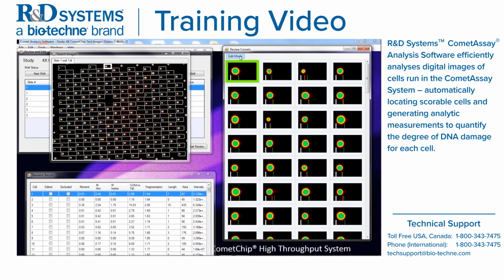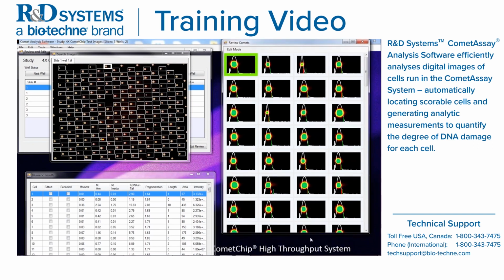The second way of editing is you can go over here into the review window. I first recommend that you go under Edit and select Show Intensity Profile. This is going to show the intensity profile relative to the comet. So in this first slide must have been untreated cells. Anyway, you can scan through here and check how well the markers are placed.